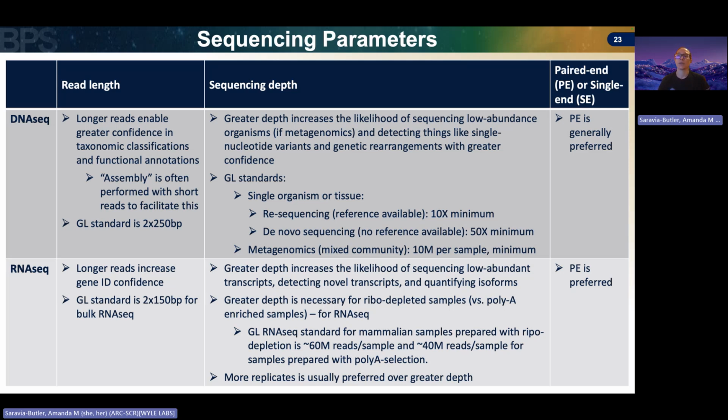I should also point out that although sequencing by synthesis works really well, we have not quite been able to replicate the conditions to make it nearly as efficient as what happens in our actual cells, where in humans we are replicating with high fidelity 3 billion bases. So we're not quite that good. With longer reads, you will see the quality fall off a little bit towards the end of those reads, as we'll see in our QC of our sequencing data that we'll get into next.